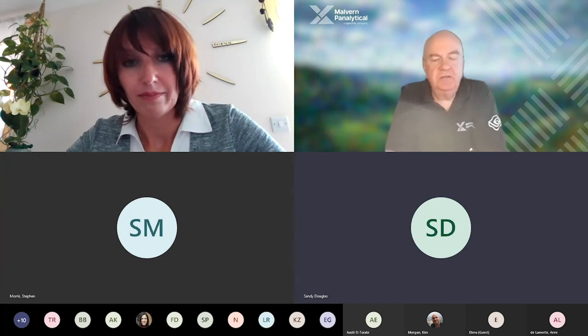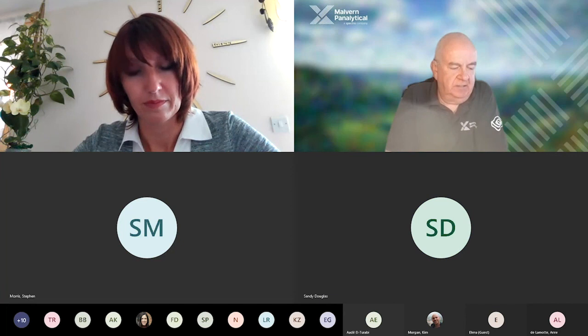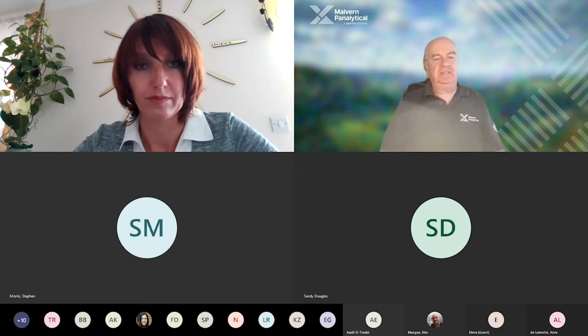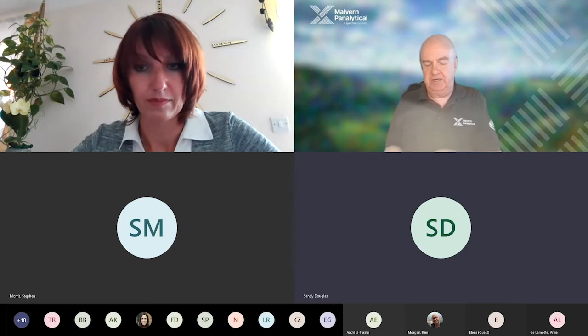In terms of DLS, that will depend on the size of the micelle and how close that is with respect to whatever you're interested in measuring in that sample. So, for example, if you had viruses in there, 30, 40 nanometers in diameter, and you had micelles, it's all about the relative intensities at the end of the day. If we're dealing with proteins, the refractive index of a protein is going to be similar to the refractive index of a micelle.